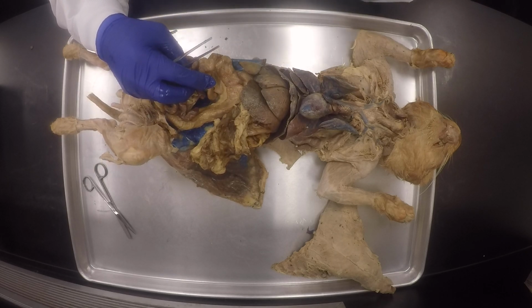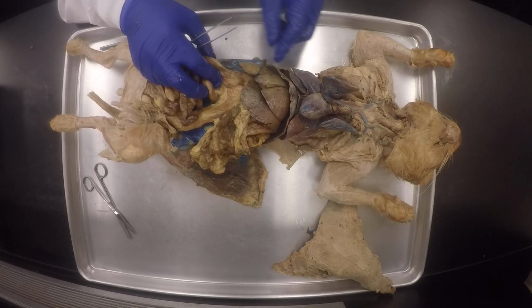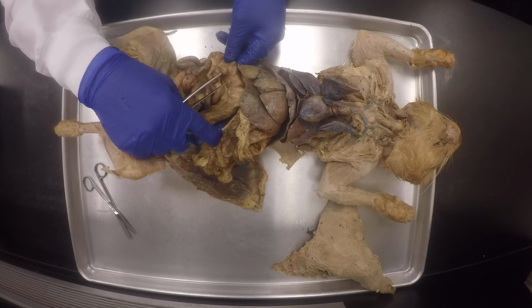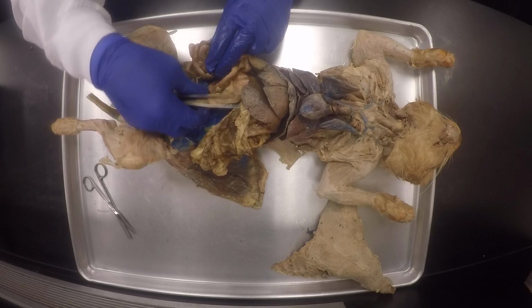So I should have labeled over there the hepatic flexure or the right colic flexure, which is a 90-degree turn in the human colon, right? And also in the cat colon, because the liver is right there, so it has to take a turn to the other side. You see what I'm saying? So this is the transverse colon, and then this one going down here would be the descending.